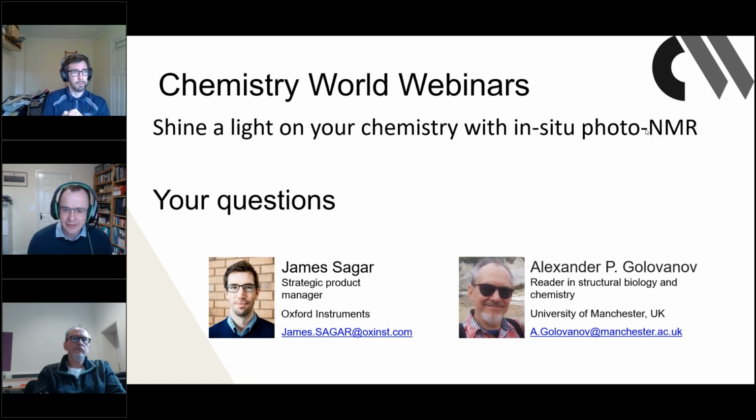Okay, so the next, I've got a couple of questions around sort of the kinds of experiments you can do. So we have a question from Eldrick, which is around what kinds of molecules do or don't work very well with their photo-induced CIDNP. Maybe I'll get Sasha to come in on that one first, but James, you might have something to add.